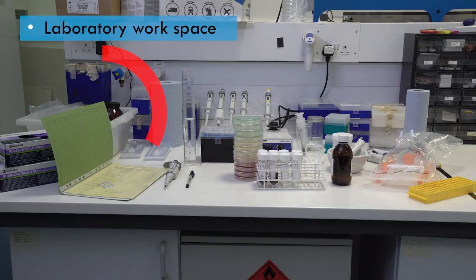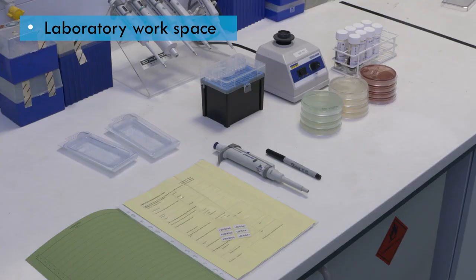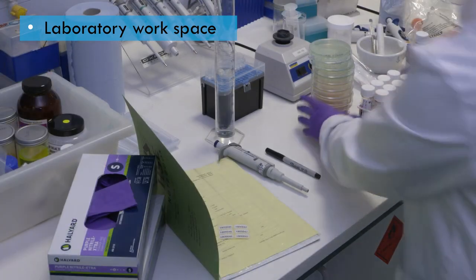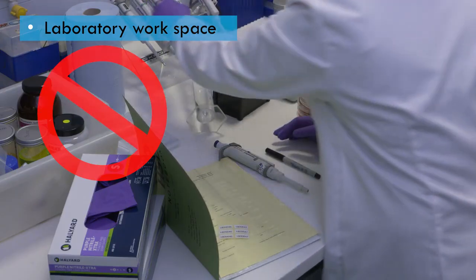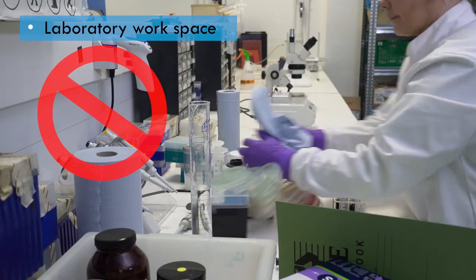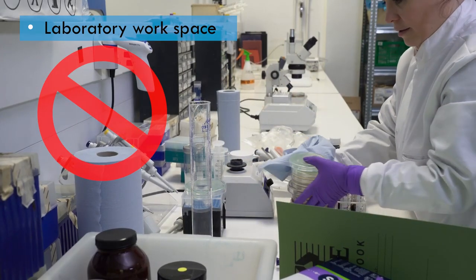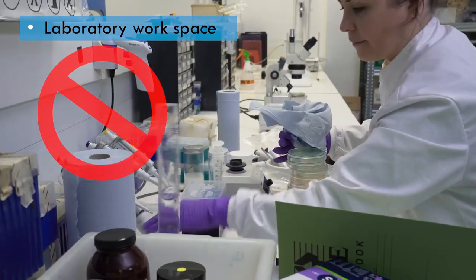Before starting work, the workspace should be clean and tidy. If possible, keep the surface clear of everything except the items needed to complete the task at hand, and keep these items towards the back of the bench to ensure you have enough room to work at the front. It's difficult to work well in a messy environment. It can lead to cross-contamination and accidents, which may expose laboratory staff to biological agents.